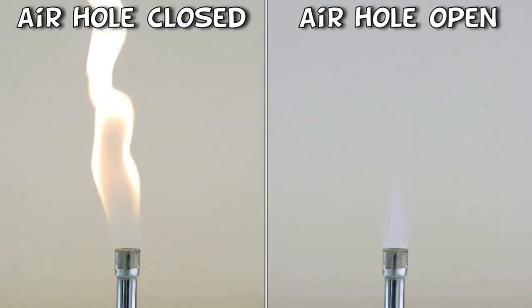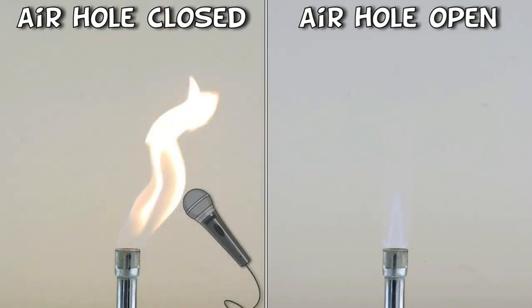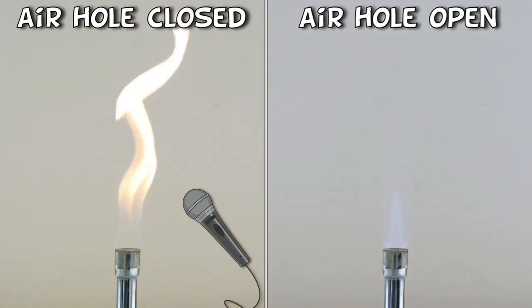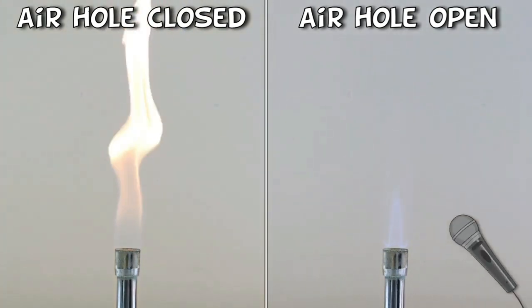And what do the flames sound like? First off, this is the yellow flame. Pretty quiet then. Next up, the blue flame.